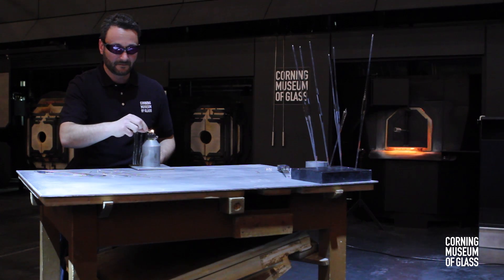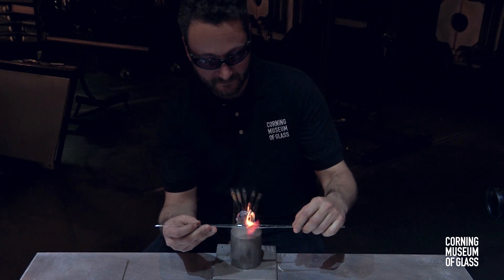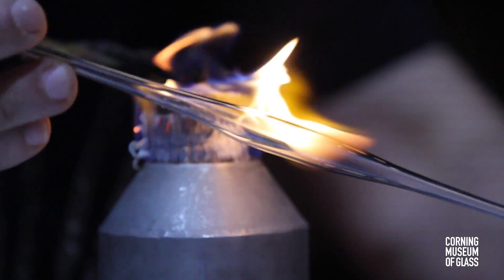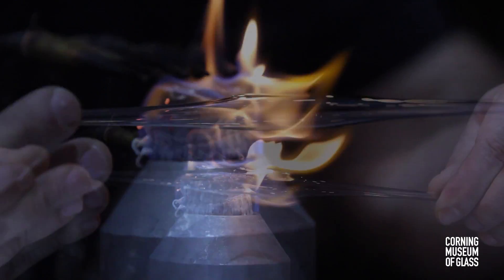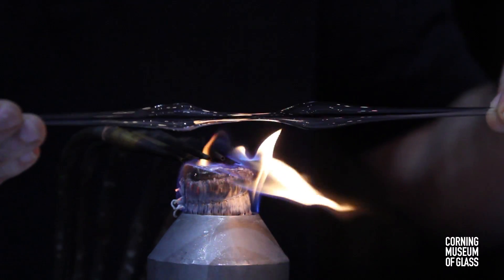Van Leeuwenhoek's letters mention an improved but still secret method of making lenses by glass blowing. This technique probably begins by rotating a thin-walled glass tube over a flame to soften it. Stretching the glass creates a tapered point.